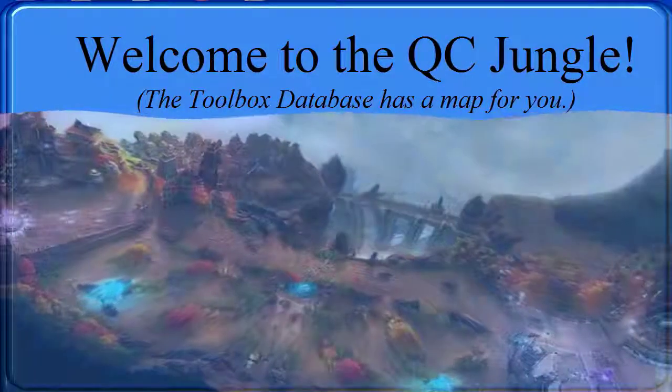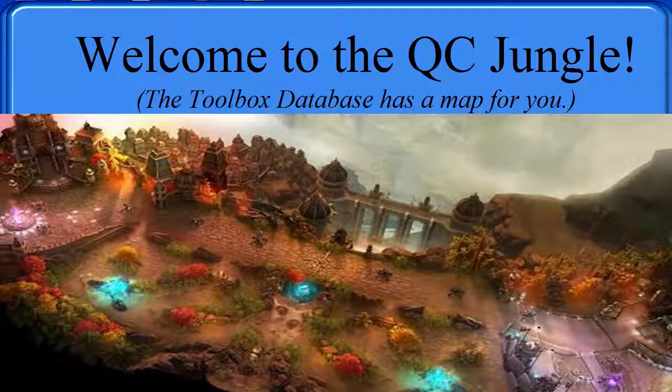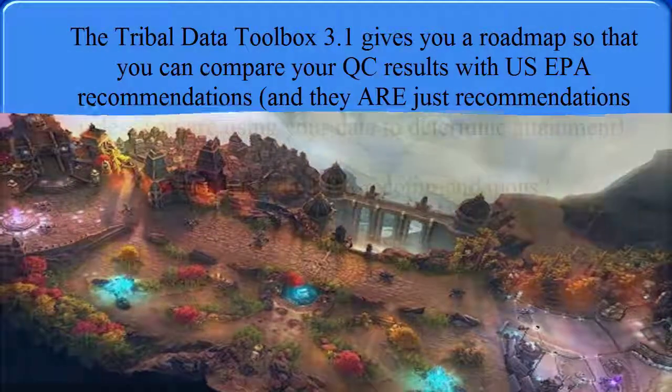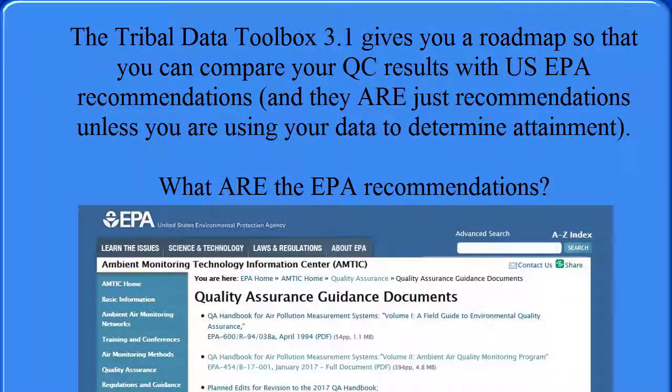Welcome to Module 4 of the Tribal Data Toolbox training, and in this module we are going to demonstrate entering quality control data into the toolbox. And by quality control data, I mean the checks that you do on your instrumentation on a regular basis to keep them up to date with the EPA requirements.